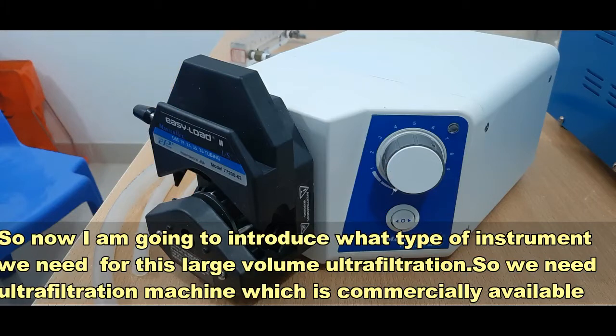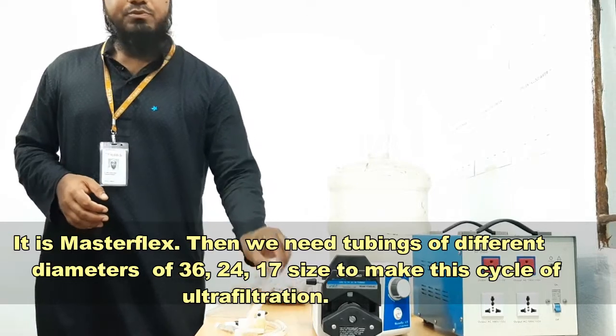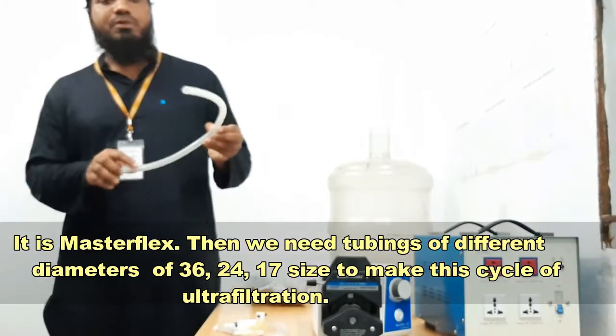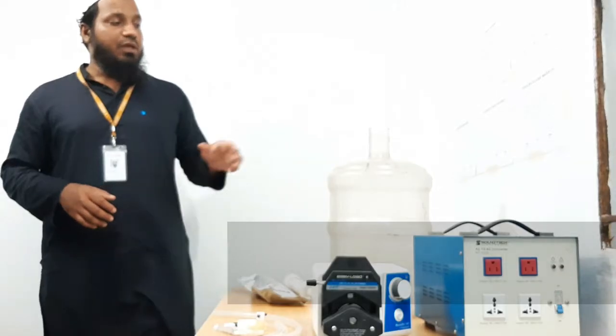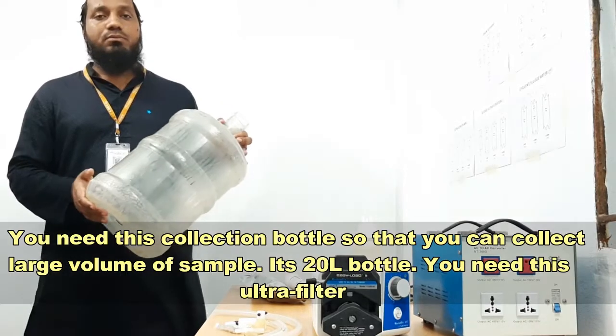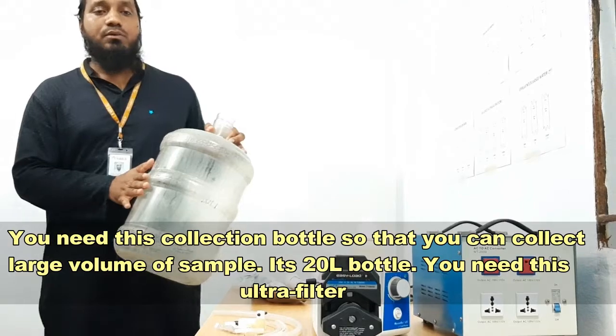We need an ultrafiltration machine which is commercially available — it is a Masterflex. Then we need different diameters of tubings: 36, 24, and 17 diameter in different sizes of plastic tubings to make this cycle of ultrafiltration. You need this collection bottle so that you can collect large volumes of samples. This is a 20-liter collection bottle.